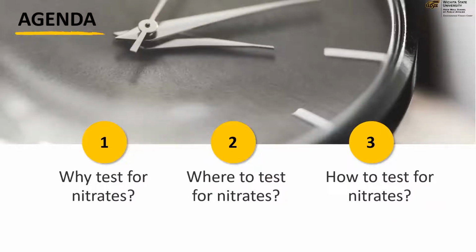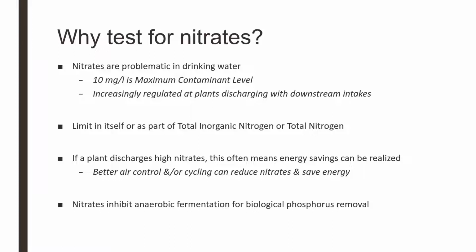So the agenda today is that we will discuss why we would want to test for nitrates at our treatment plants, where to test for nitrates at the treatment plants, and then how to test for them. So why are nitrates an issue with wastewater treatment?